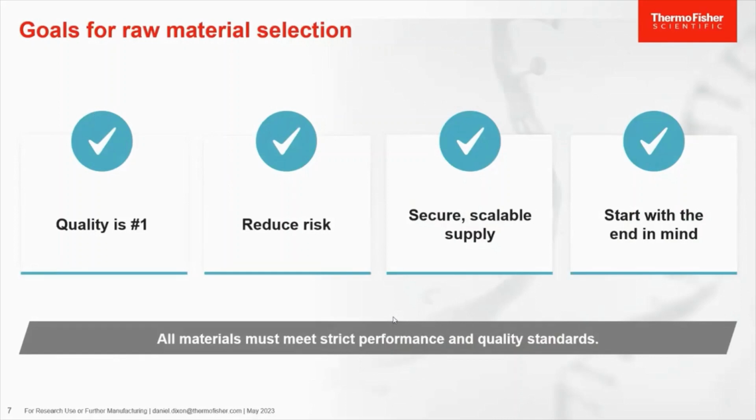Finally, start with the end in mind. That means to think about what the final process is going to look like at full scale from a procedural, parameter, and materials perspective. Keeping these 4 goals in mind ensures a smooth, low-risk process.